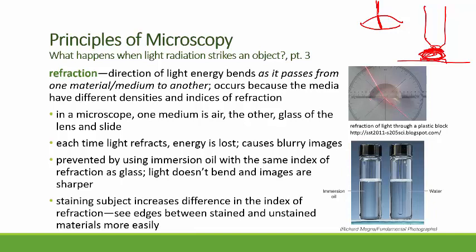So here we're seeing refraction occurring. This is a block of plastic. Here comes a laser light. Boom, light is coming, and it refracts, and then it refracts again just a little bit as it comes out of the block. So we see two examples of refraction when we are passing light through this block of plastic.